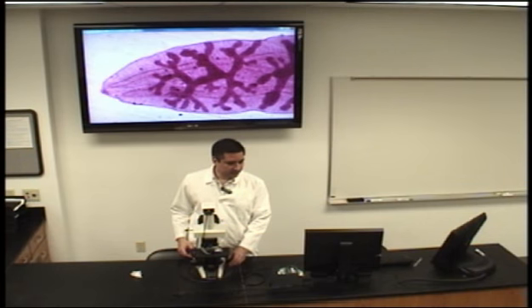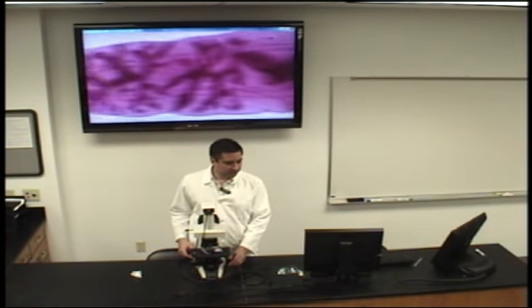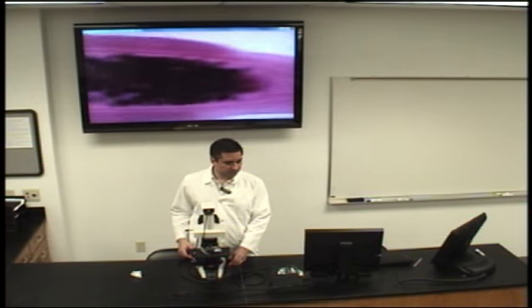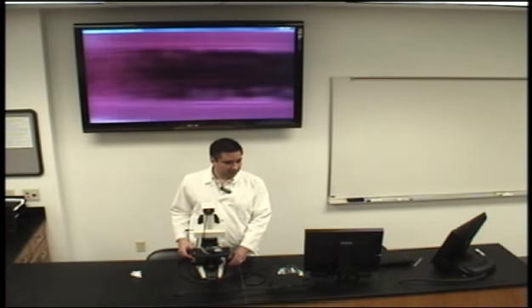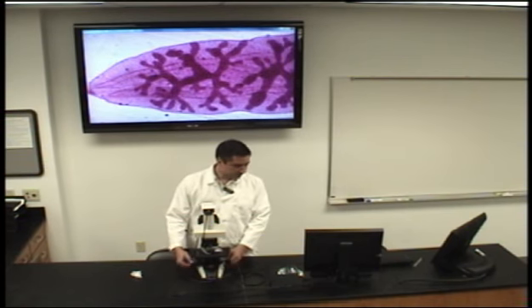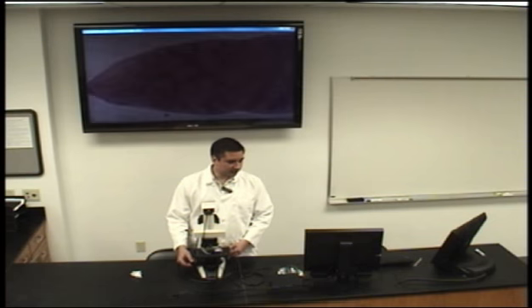And this is in real time, so you can notice that there's relatively no lag at all in the controls. And we can do anything with it, adjust the lighting, whatnot.